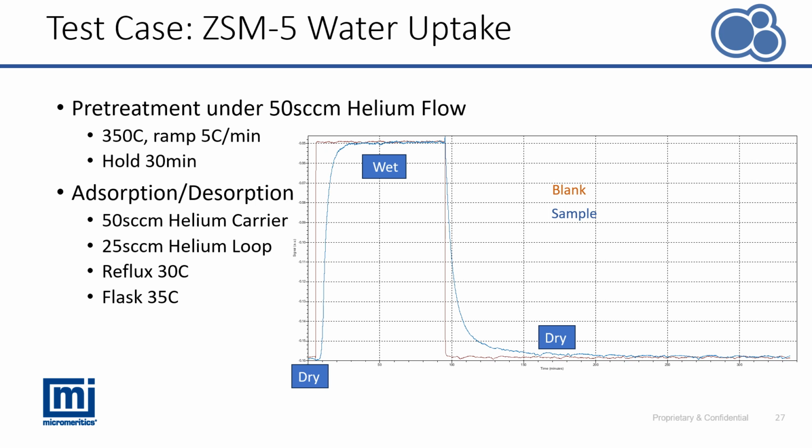The wet to dry curve allows comparisons for desorption. The blank sample reaches a dry state rapidly. The sample shows a delay as well due to the desorption of the vapors. However, note here, the desorption curve takes a considerable amount of time before it reaches the baseline, seen on the blank.